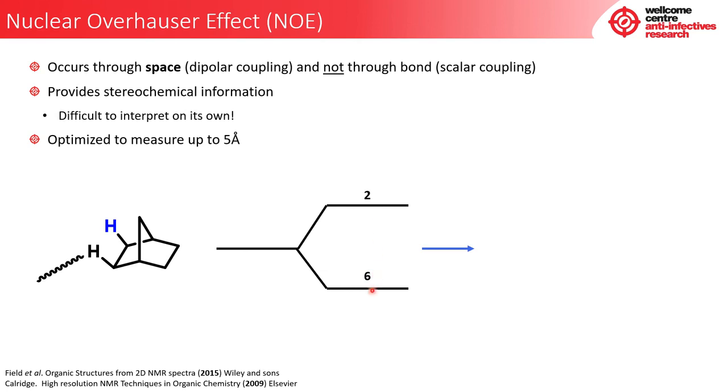So once this pulse has been applied, what we see is a change, the same happening in these energy systems. And what happens in the low energy system is that the nuclei get excited and move into this high energy state. And in doing so, it causes this equilibrium between the low and the high state.